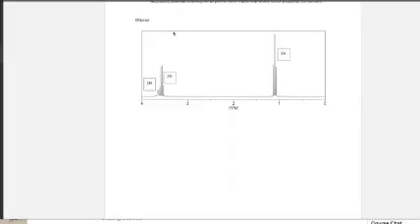All right. Hello, everyone. Today we will learn how to read an NMR spectrum, and we will cover the number of signals, position of signals, integration of signals, and spin-spin coupling. All right. So the first example we would do is ethanol.